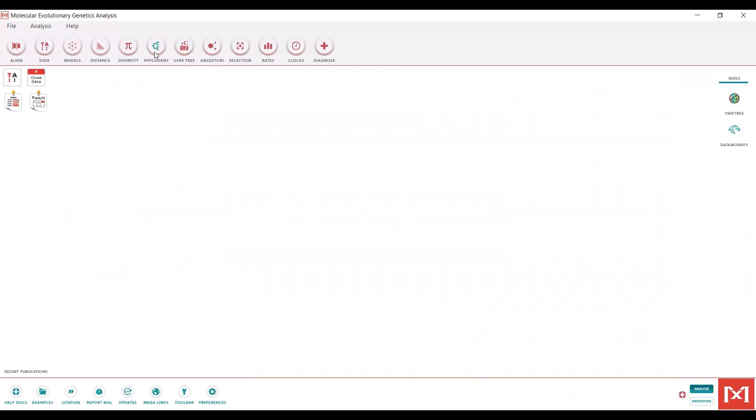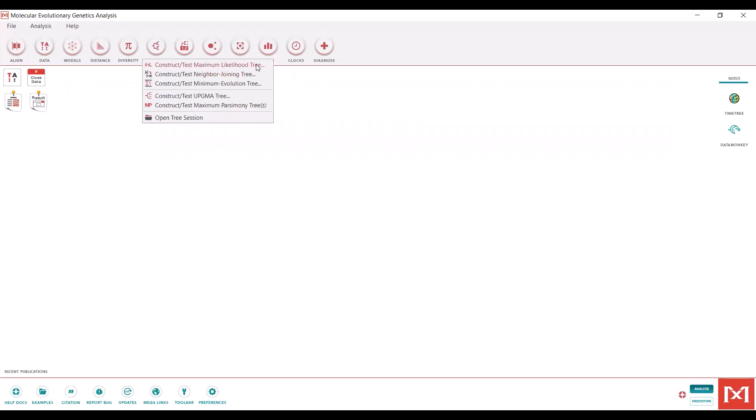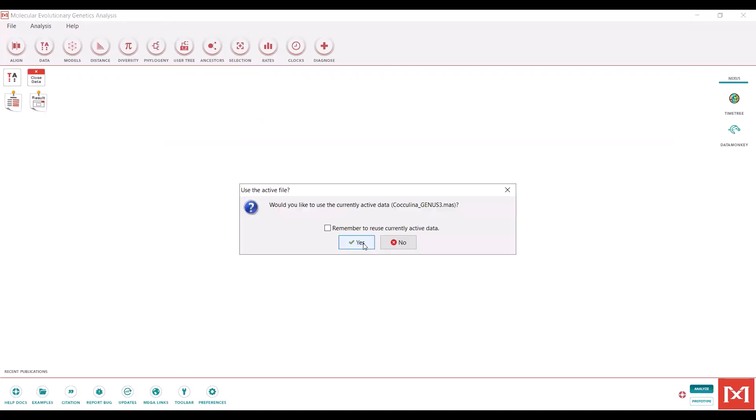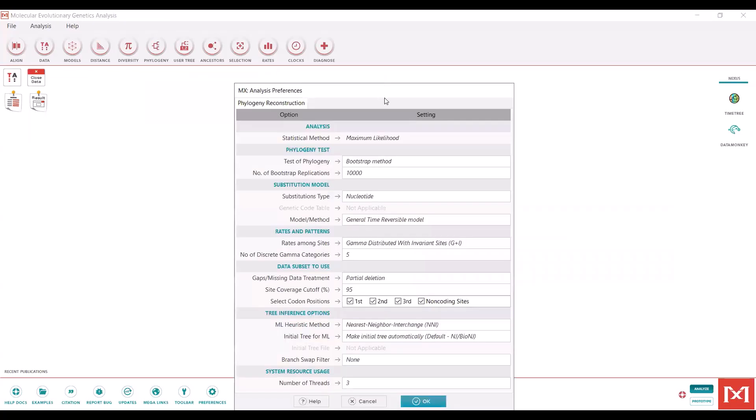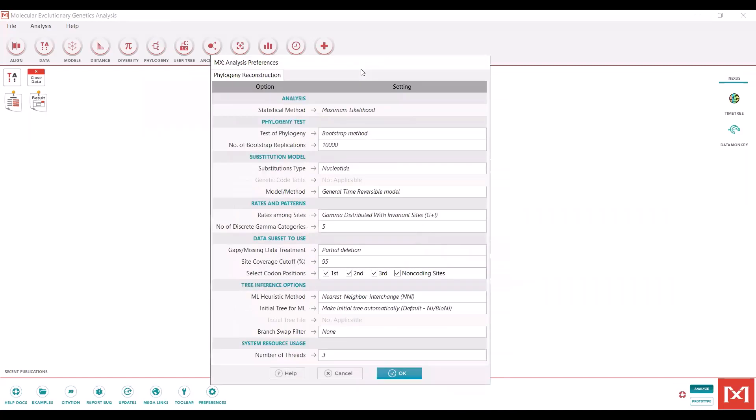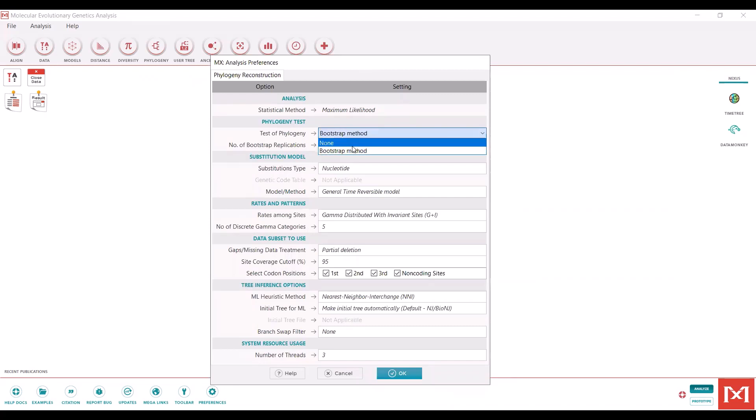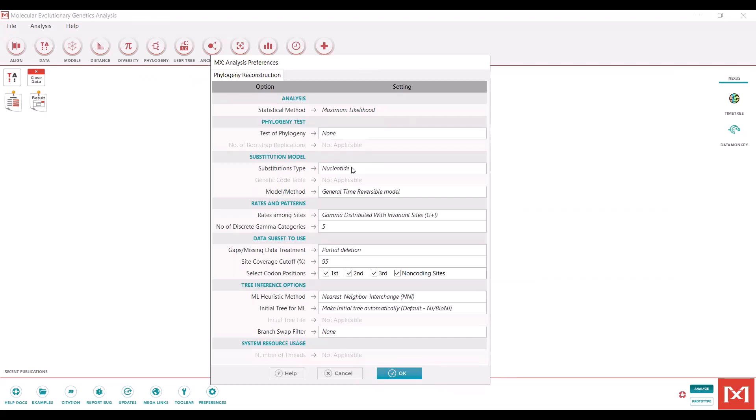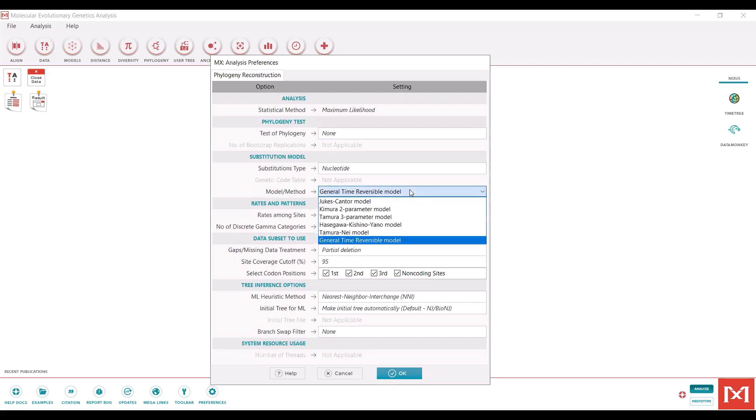Then we will go to the phylogeny button here. We are going to be constructing a maximum likelihood tree. We will be using the active data. This window pops up. To start out with, I would personally just do a test of phylogeny set to none. That is just going to be a quick check of whether the results look like what we expect. The substitution type will be nucleotide. We're going to use the model that was selected as the best fit according to MEGA, which was the general time reversible model with g plus i parameters.